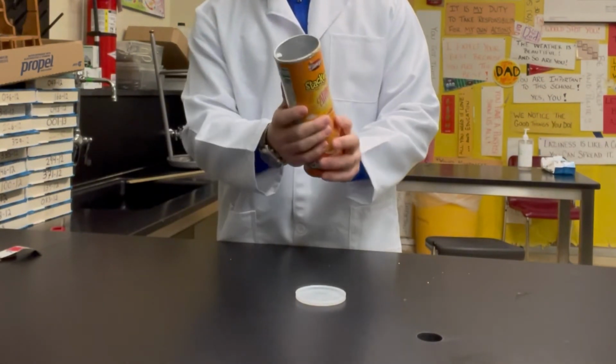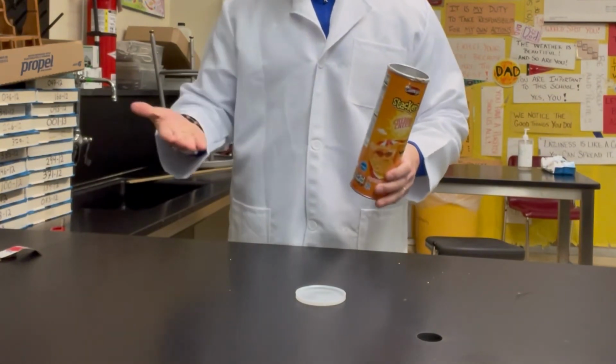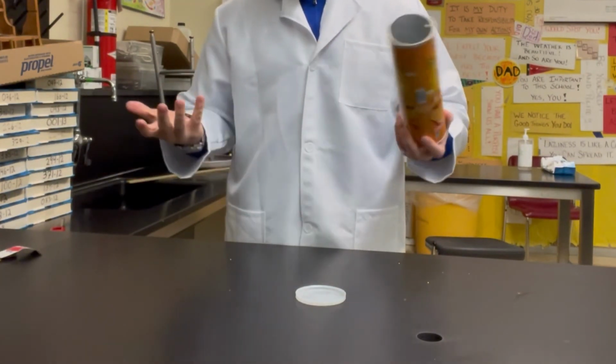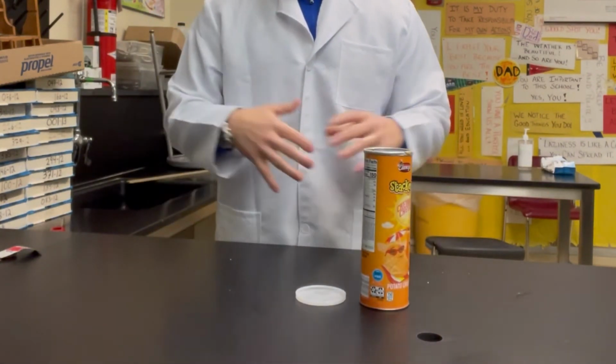You can feel the heat given off. And that's a second type of reaction. When hydrogen gas reacts with the oxygen because of the energy, you get a combustion reaction. All right, but in the end, that was single replacement, us doing it in a fun way.